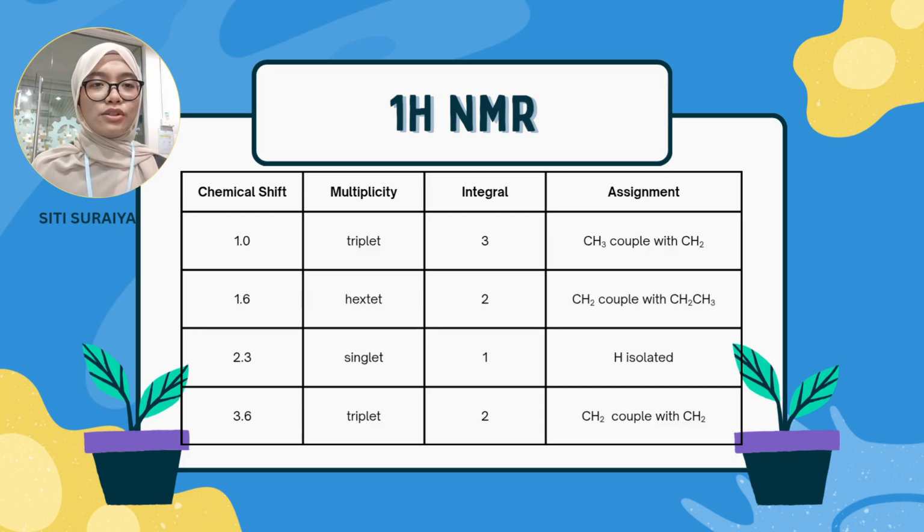Assalamualaikum. My name is Siti Suraimati Zainal. My matric ID is SA23008. Let me walk you through the interpretation of the proton NMR spectrum for our compound.